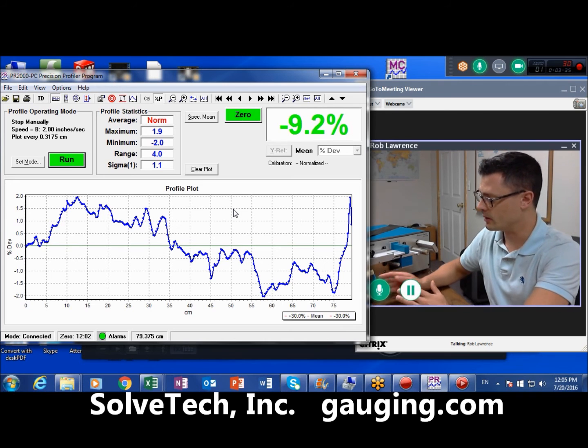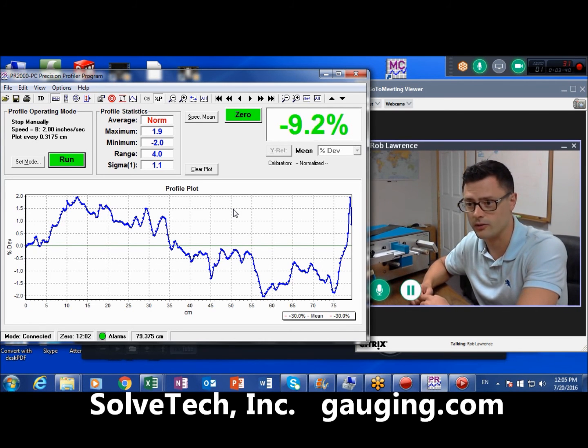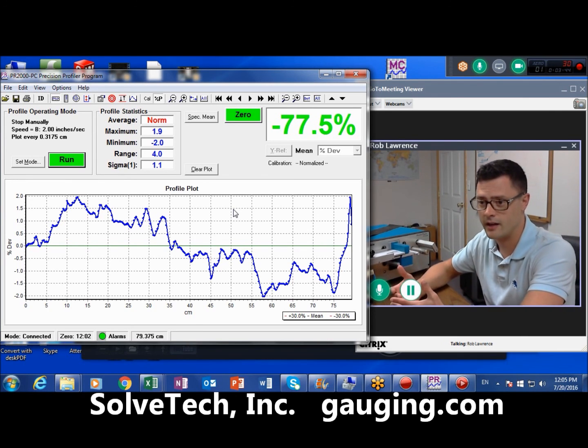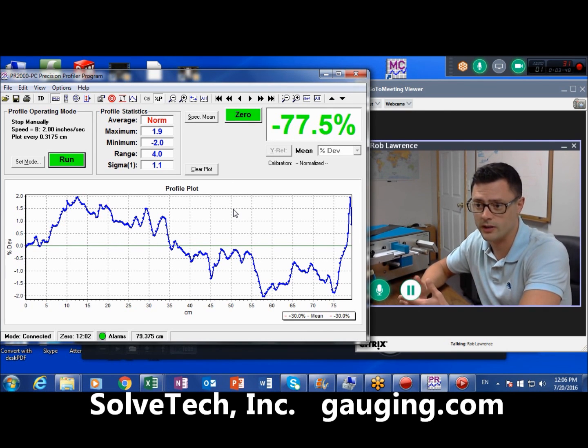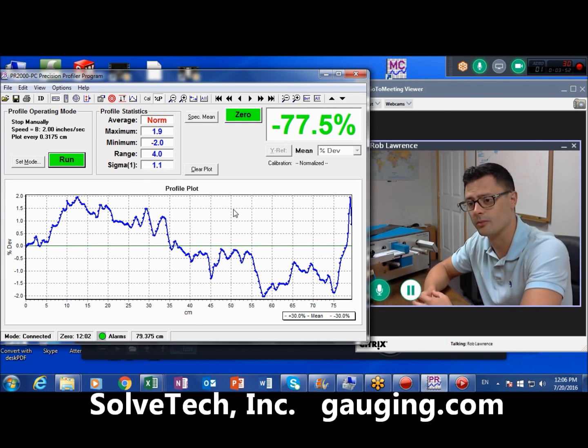So when we're looking at material variability on a film like this, obviously the contacting method is not going to be enough for us. So we're really going to have to go to something more precise, like a non-contacting thickness gauge. And again, it's all dependent on your needs for your process. And again, this saves time, and it's also capable of a NIST traceable calibration.